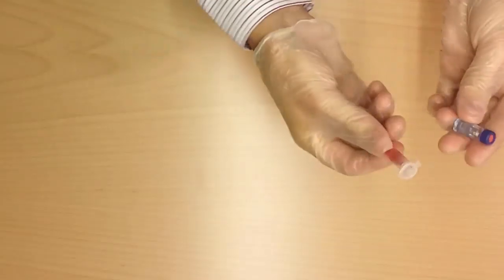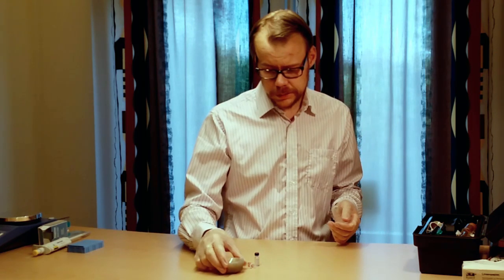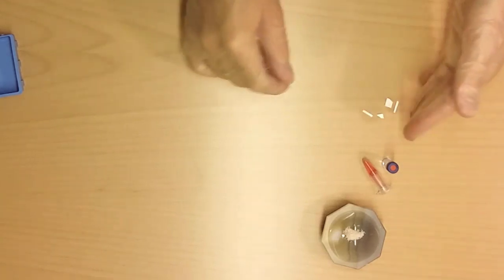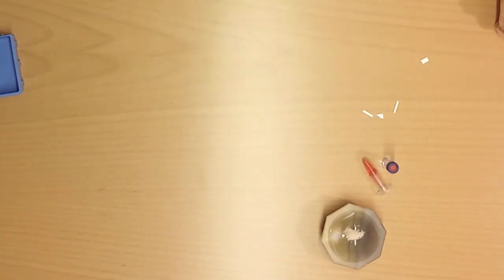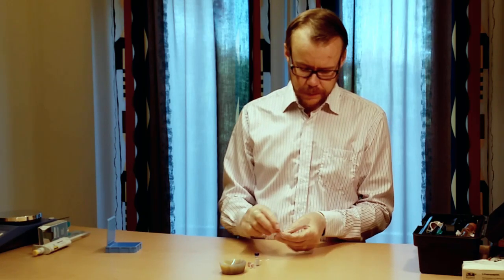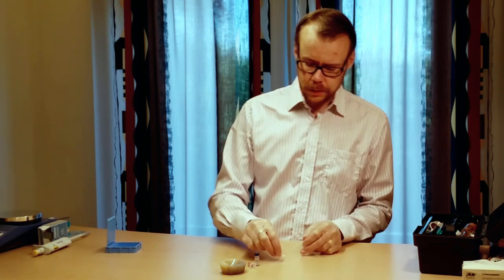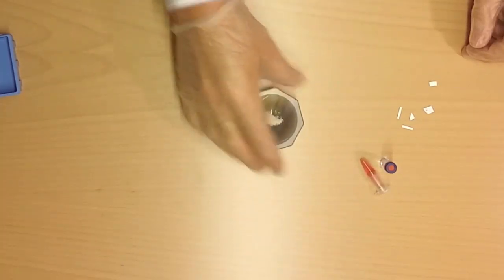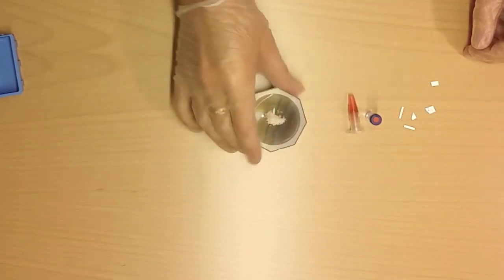For example, materials can be of liquid form like this, and they can also be of powder form like this. Or they can be some more complex device, like something that is printed on top of paper, for example, some nanomaterial or some electronic component or something that you want to study. So these are all a few examples of the things that you can encounter.